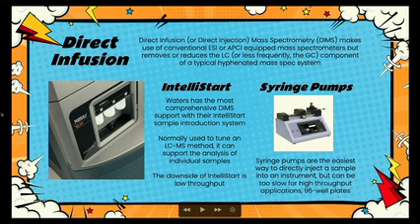But it can either remove or reduce the LC, or less typically the GC component, and gets a sample straight from an extract from a vial into the instrument without having to go through a chromatography column and without having to have all of the time-consuming option of setting up the correct column, doing a lot of method development, and can get an answer as to what's in a sample in a few seconds rather than the minutes or longer that it would take if you were going to do a conventional LCMS run.